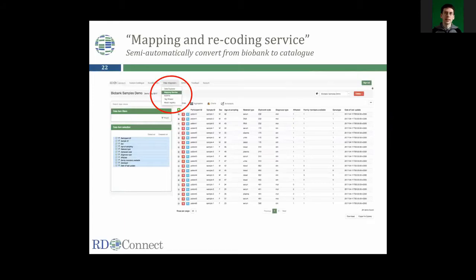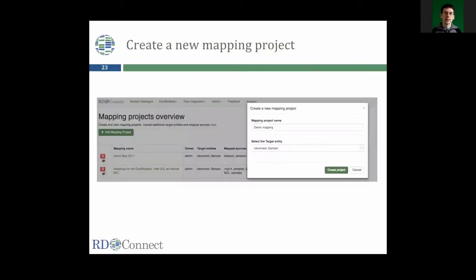At least in the coming period until the end of the financing of the RD-Connect project, we can help you with our data managers to create a mapping of your data. The first step is that we go to the mapping service and create a mapping project.